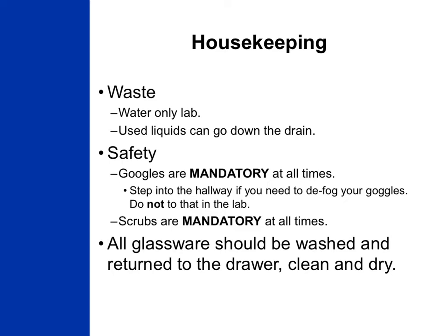A couple of housekeeping notes for this lab experiment. While we will only be working with water this week, to help you build lab safety practices, you are required to wear scrubs and goggles during lab. You should also wear gloves anytime you're working in the lab as well. Because we are only working with water, any waste at the end of the lab can be poured down the drain. It is also important that you clean the glassware you will be using both before using it and when you are done with the lab.